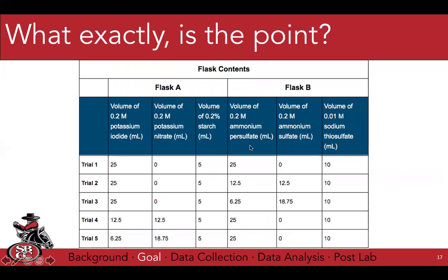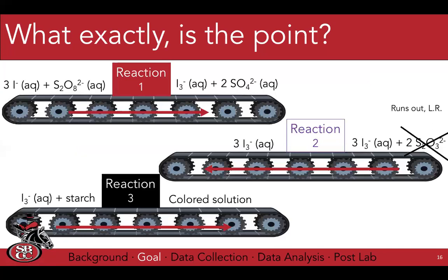Do you have a question, Sophia? Yeah, sorry. Just to imagine it, because I haven't really read the lab procedure yet. Does one happen next to the other? Do you have 3 different flasks where the reactions are happening, and then when it turns red, you know it's time to put on reaction 2, and when it turns the other color, you know it's time to put on the starch reaction? Well done. That's a great question, Sophia.